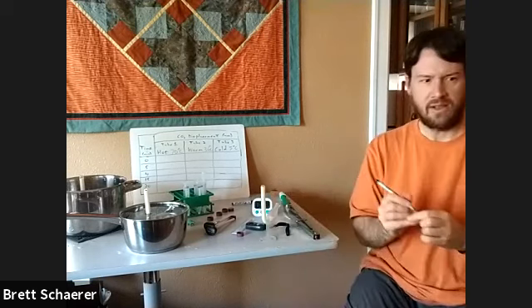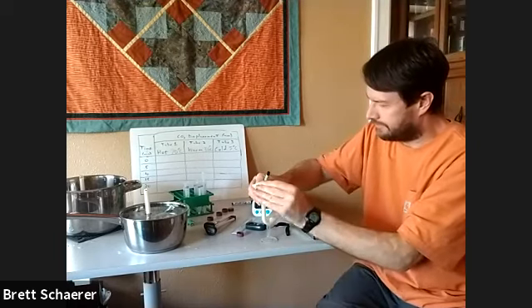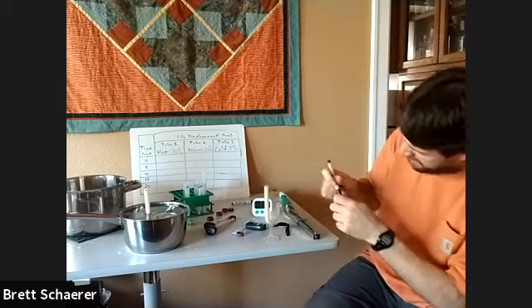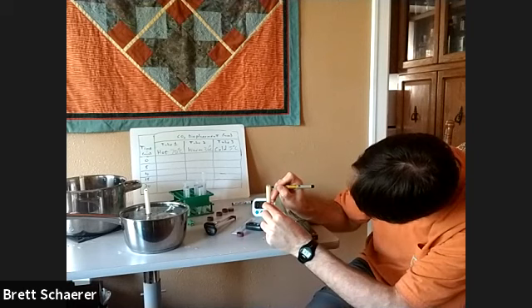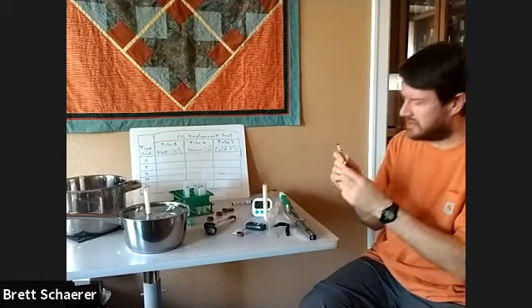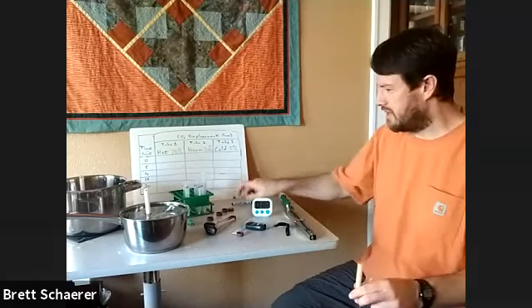No, too much condensation. Okay. Now the tubes are marked, and we will wait until the 5 minutes are up and then measure them.